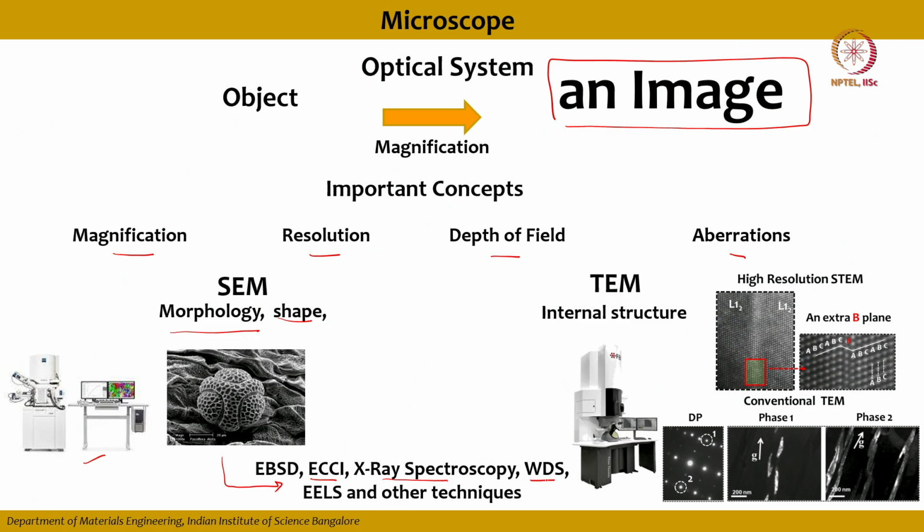We can also use WDS. Okay, so we will also cover some basics related to WDS, which is wavelength dispersive spectroscopy. The difference between the X-ray spectroscopy and wavelength dispersive spectroscopy is related to your energy resolution. Then, so this is your scanning electron microscope.